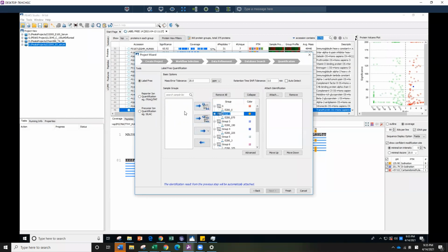I just do a simple version, because when you have your output, you will find you have a group and an individual. Since every sample is its own group, you actually will have two sets of identical numbers in your output.